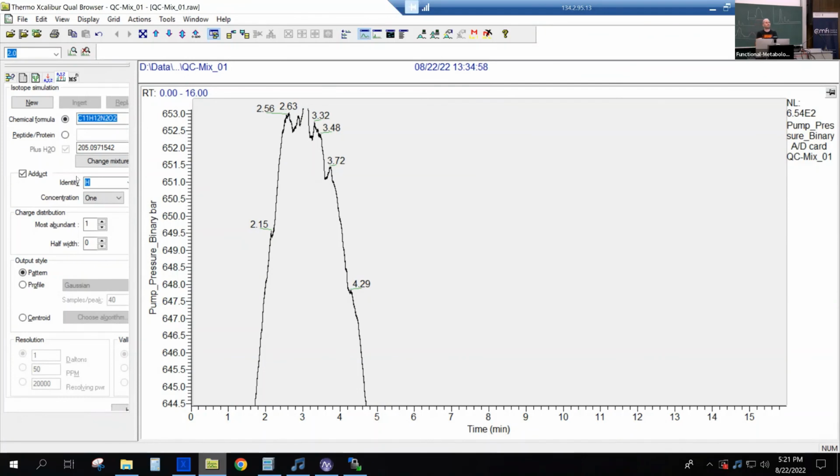And you said that in your experience, high organic concentrations of the eluent are bad, over 95%. Interesting. I don't think we can avoid going to 99% acetonitrile. I was wondering why I'm thinking of 100 for the wash. We always like both pumps to run a little bit, right? Because we have a binary pump, so it's a high pressure gradient system. One pump pumps only water, the other one pumps only acetonitrile. If I would go to 100, one would stop. So it's a common thing that you always maintain them at a low flow rate at least.